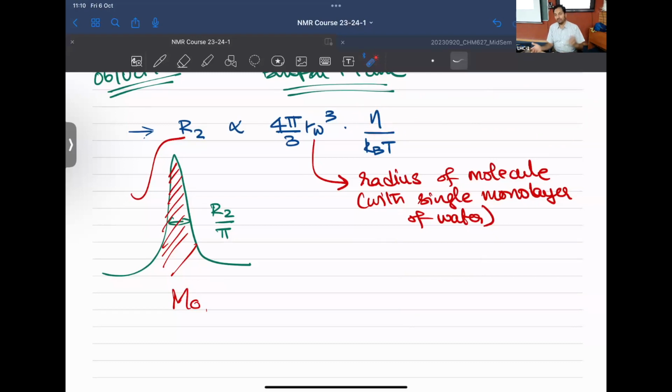And you all know, I just showed you last week that you have to use a deuterated solvent to do field frequency locking, in which case you cannot evade using D2O when you're using H2O samples. Some amount of D2O has to be there. So that does play a very small role.